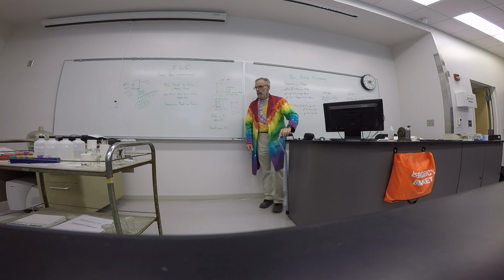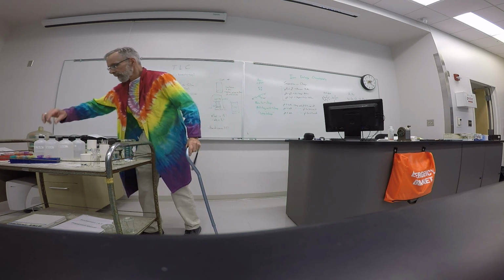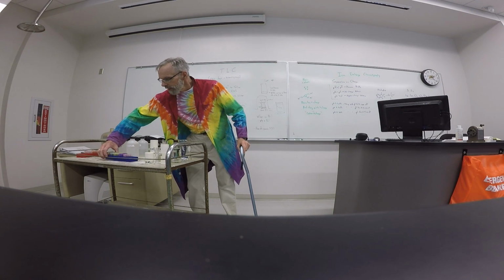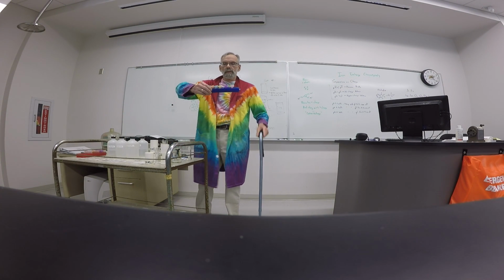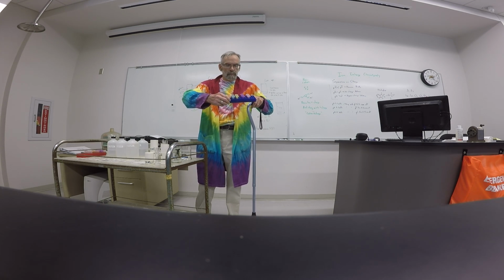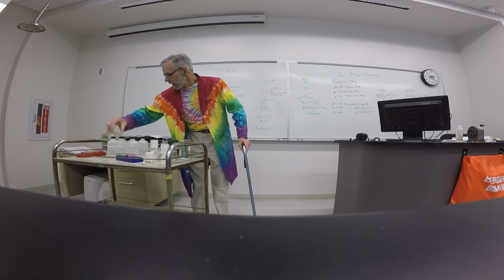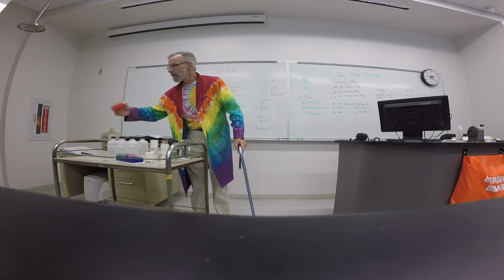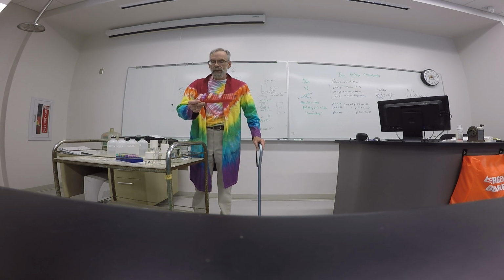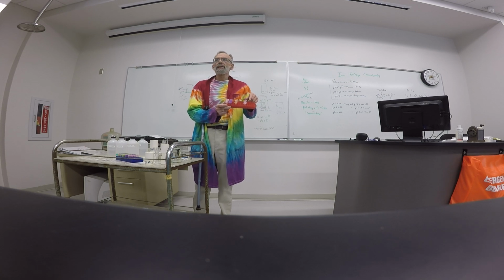And okay, so up here is this blue one, a set of lots of the individual amino acids, and I have 5 different sets, so you can spread them out a little bit. On this one, we've only got our choice of 3 different unknowns, A, B, or C, and over here is the BSA sample.